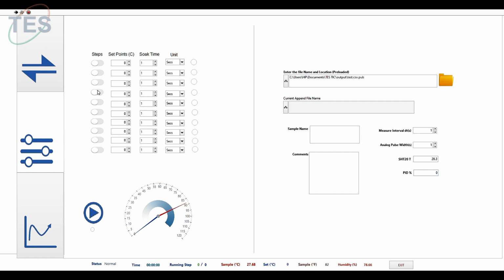So we're going to set a temperature, maybe 3 steps, starting with 35, and maybe for 2 minutes, and the second temperature I'm going to give is 45, and the third one is 55. So I'm going to run this for every 2 minutes, and as we know, soak time is nothing but, once it reaches the PID value of the set point, it will execute the duration of 2 minutes only after reaching this temperature, 35, 45, 55. So we are maintaining this temperature for 2 minutes, so that is called soak time.